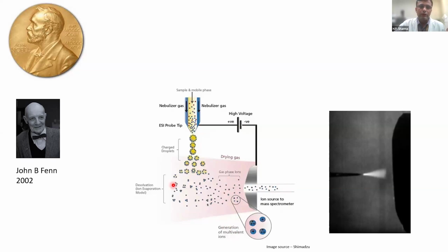If I tell you how it is different from gas chromatography, there you are directly converting the sample into gas, but here it's indirect drying. So you are preventing your thermolabile molecules from degradation, because you can increase or decrease the temperature on the basis of your analyte of interest. And when you look from the source window, you could see some sort of discharge like this.